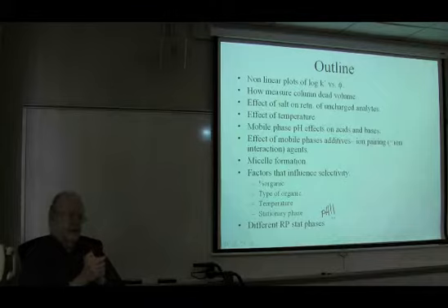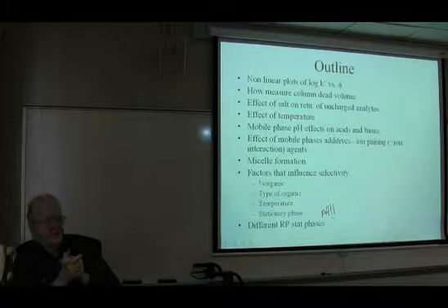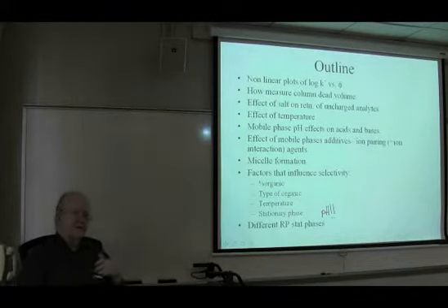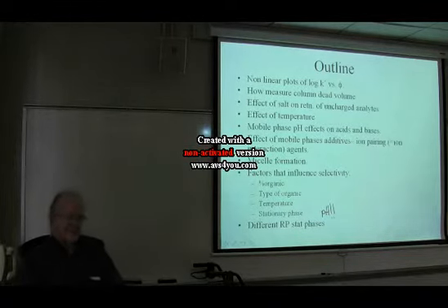For instance, with water acetonitrile, you can work down at 210 nanometers, which is pretty far into the UV. Water methanol is a little bit higher, maybe 220, 230 nanometers. Water THF is a little bit higher than that. These are all important issues. The further into the UV you can get, generally speaking, the more compounds you can see. But you don't want to see your organic modifier, so there are some trade-offs there.